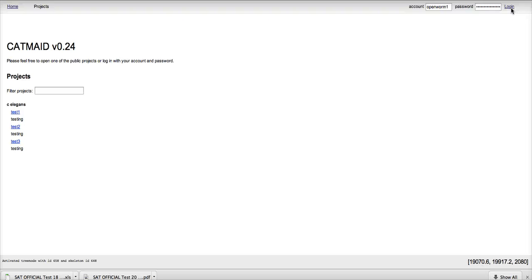Hi everyone, I'm Stephen Cook from the Emmons Lab, and if you are watching this video, it means that you're interested in annotating some neurons in the C. elegans ventral cord using CATMAID.